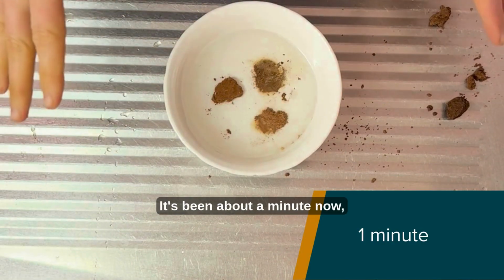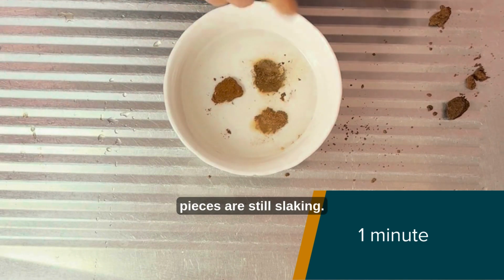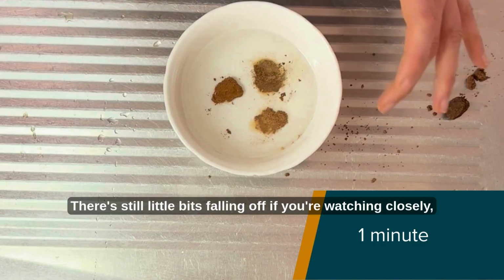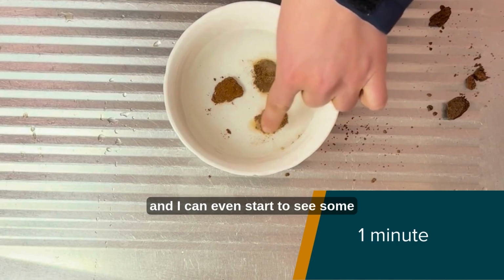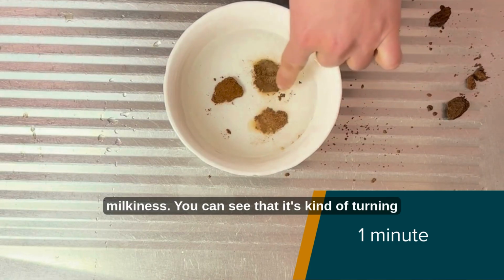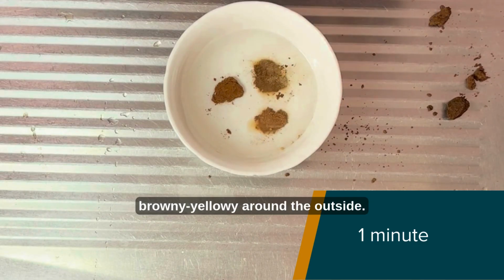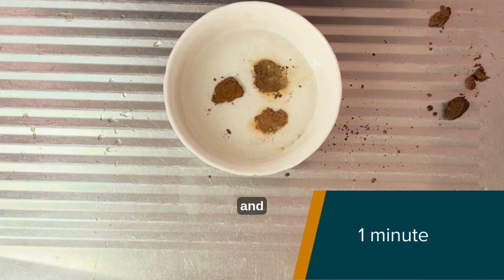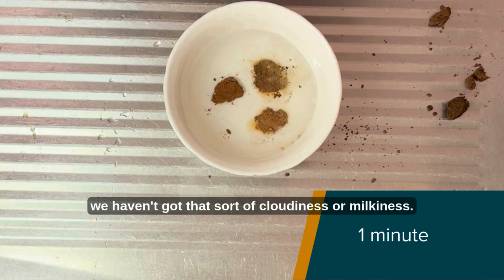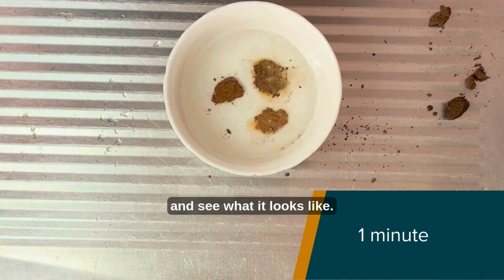It's been about a minute now and you can see these two other pieces are still slaking. There's still little bits falling off if you're watching closely. And I can even start to see some milkiness. You can see that it's turning browny yellowy around the outside. However, this original piece is holding together and we haven't got that cloudiness or milkiness. Let's come back in 10 minutes and then in 20 and see what it looks like.